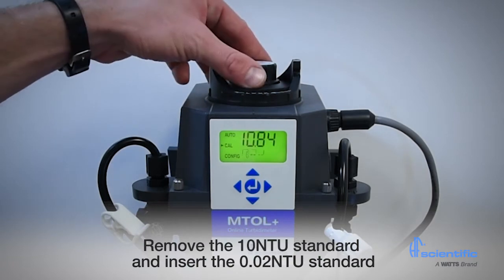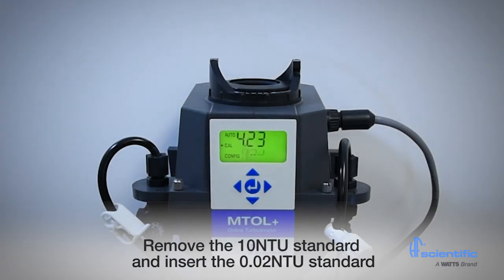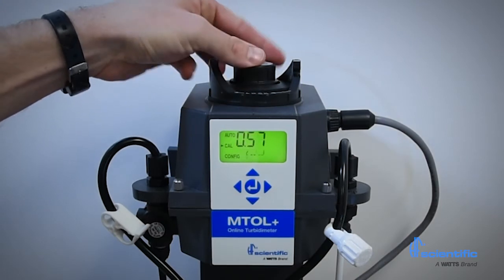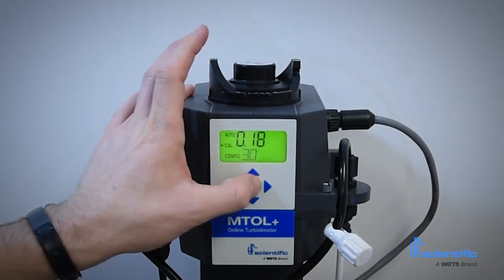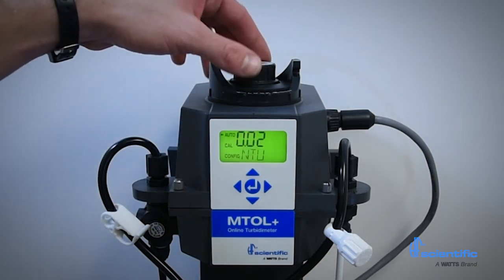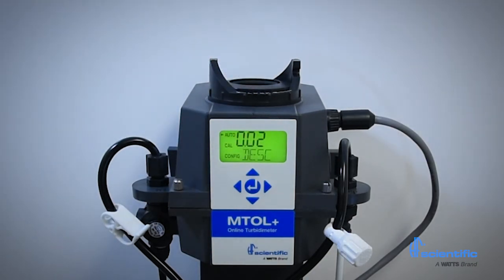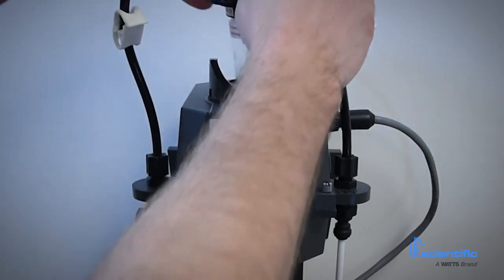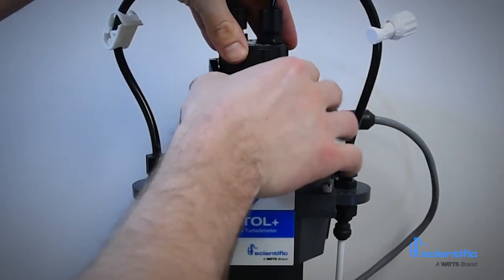Remove the 10 NTU standard and insert the 0.02 NTU standard. The display will count down 30 seconds. The calibration is now complete. The MTOL Plus will automatically enter the auto mode for routine turbidity measurement. The MTOL Plus only stores successful calibrations. If a calibration fails, the instrument will use the last valid calibration.